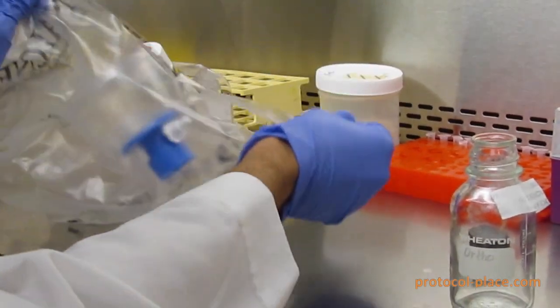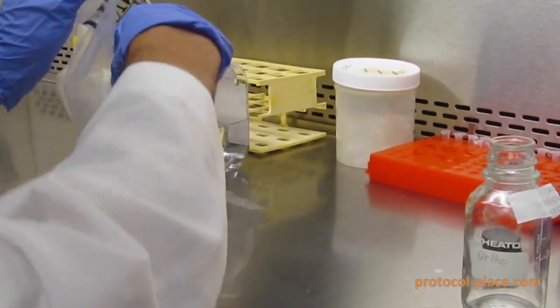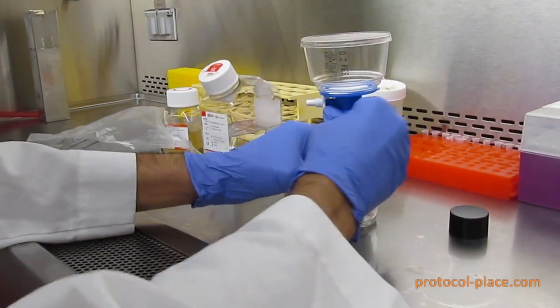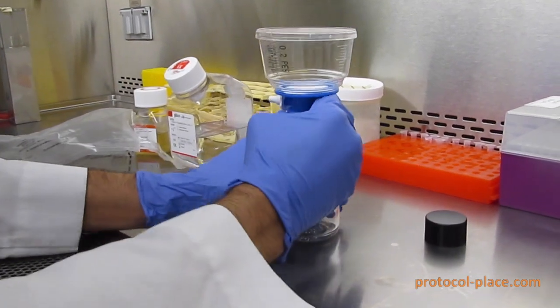The first thing you're going to do is open up your bottle and unwrap the sterile filter from its packaging. Then you're going to attach the sterile filter to the top of the bottle.